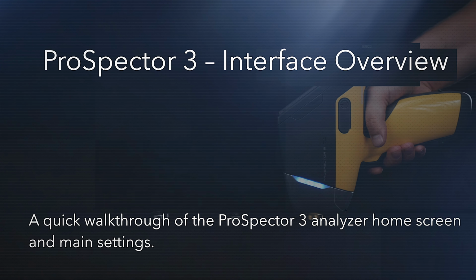So the next one is voice. As I have told, if you need a sound that will indicate that the measurement has ended, you can turn on this option. Auto rotate screen, it's very easy. It's the same as on a mobile phone. If you rotate the analyzer, the screen will rotate also.